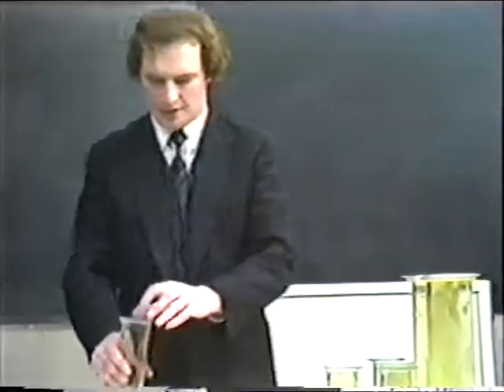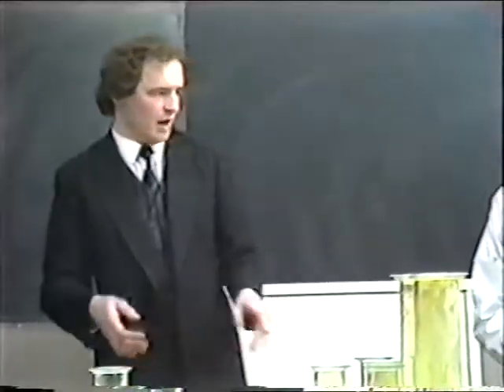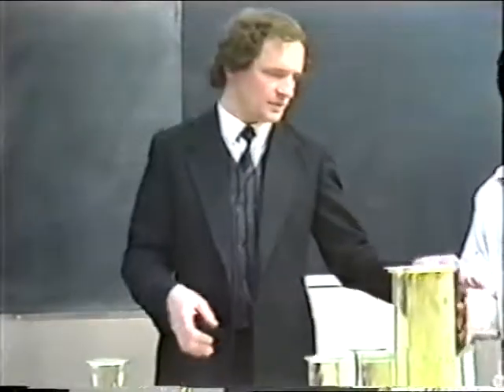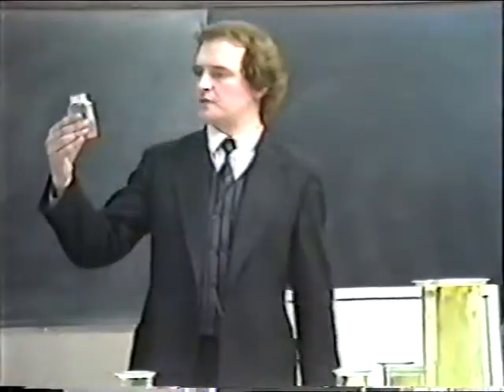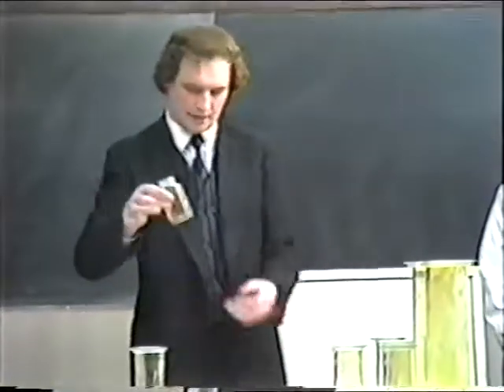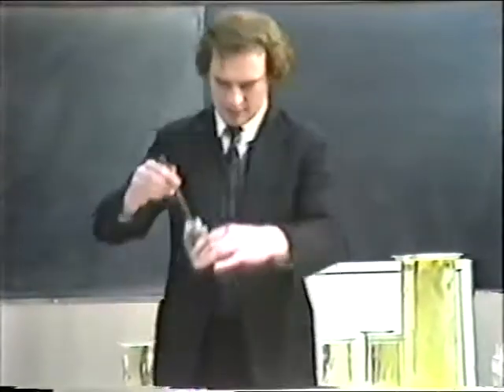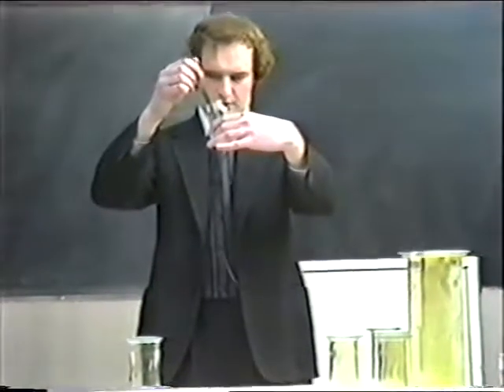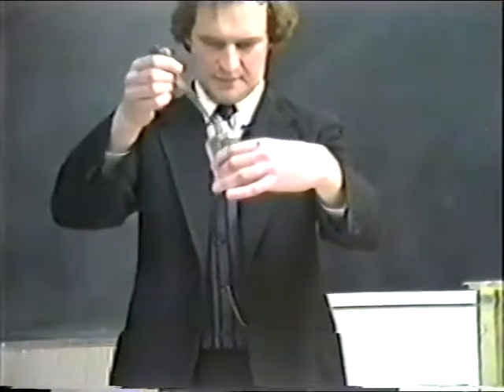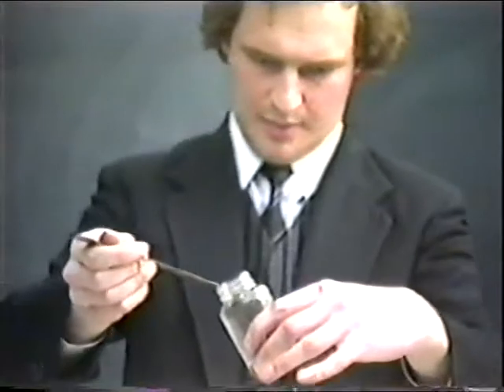Right, the next reaction is that between chlorine and a very dangerous element, white phosphorus. It's very dangerous because white phosphorus catches fire as soon as you expose it to air. Now you might have observed, as I'm holding this bottle, that the phosphorus doesn't appear to be very white. In fact, it seems to be more yellow. Well, it's also known as yellow phosphorus. It's historically been known as either white or yellow. I have here a sample which I must admit looks far more yellow than it is white.